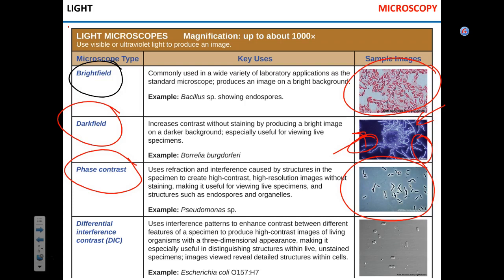This microscope does not have the capacity to produce phase contrast. This one does, and I will try to mount some sample when the time comes and show you what phase contrast is. I'd say it's overhyped. I mean, it's cool, but not incredibly awesome. Okay.